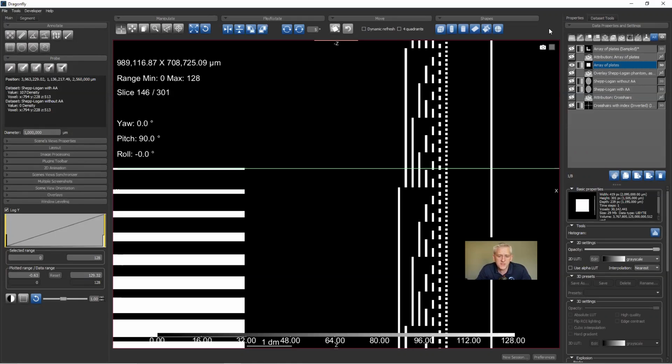But when you do resampling, if there's any rotation or any shift in the origin of the box, then you could possibly introduce interpolation. So that's a trade-off. And like I said, we could get into a whole lecture on what interpolation is and what it means and why it happens. But I just want you to be aware of it.